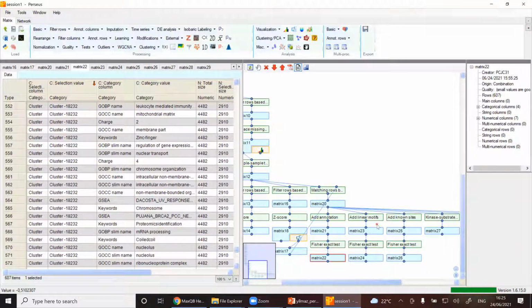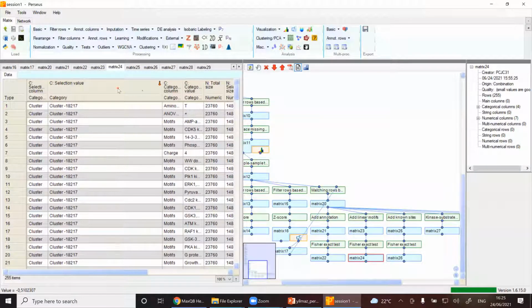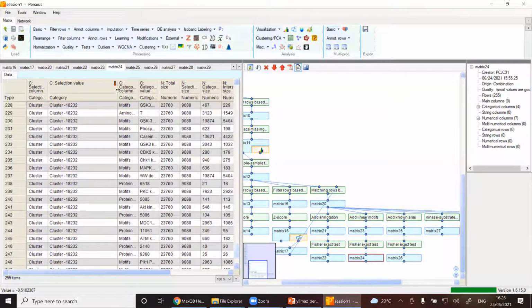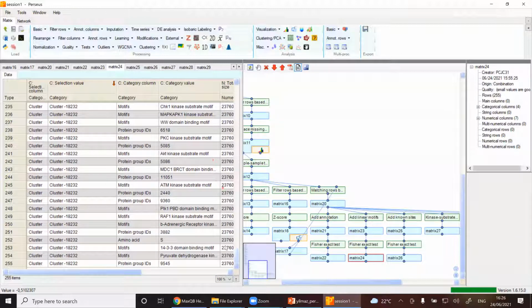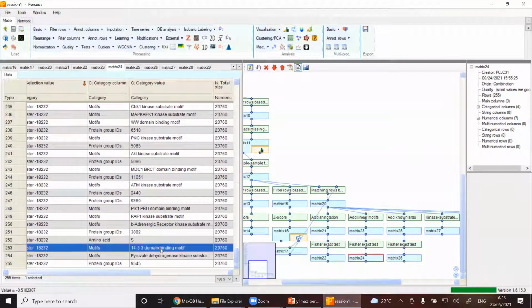And if I go to, let's say, the motif, again on the cluster-wise, I can sort, and I go to the last one. So we could also check the literature afterwards. Is this motif, the one that I found, related to maybe mitosis, or is it more than not, it's pure biology you will find.